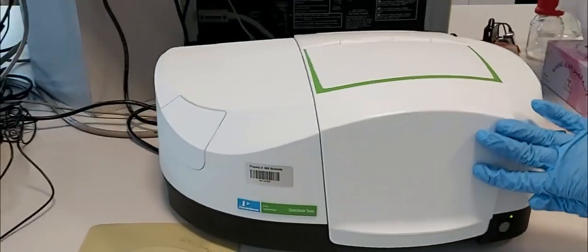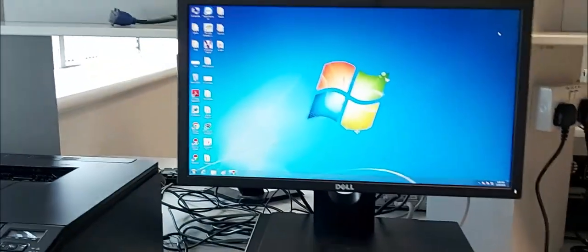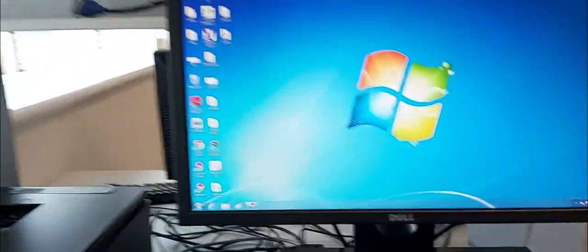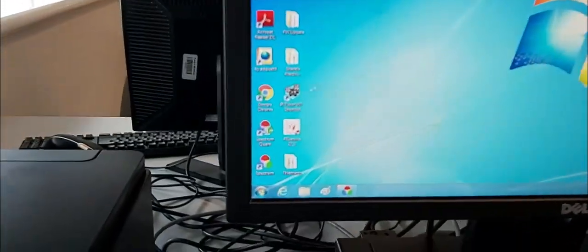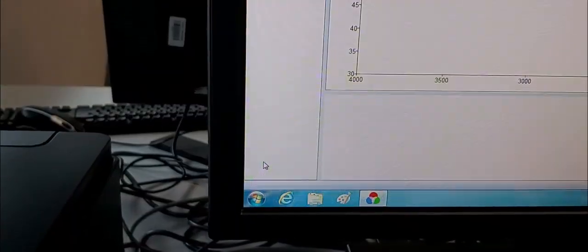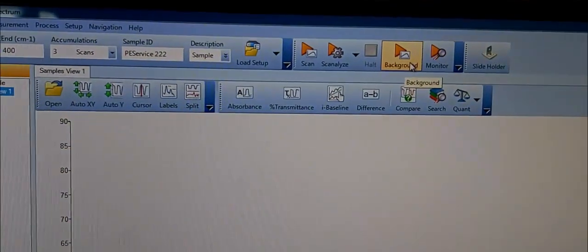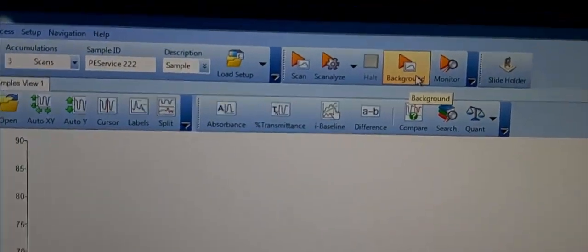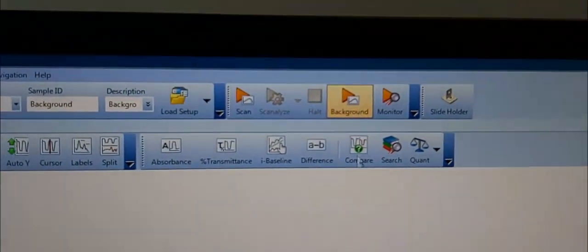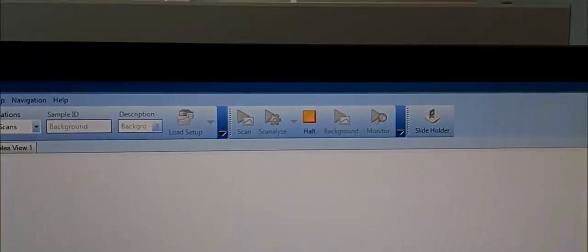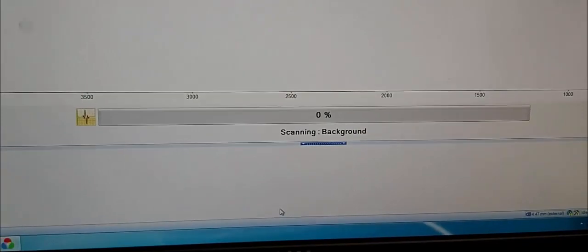Then we go to the computer and open the software Spectrum. We click on Background and the software registers the IR spectrum of KBr alone, saving it internally as the background reference.